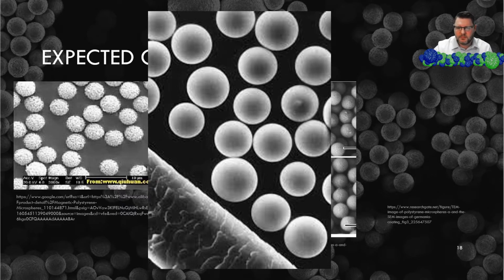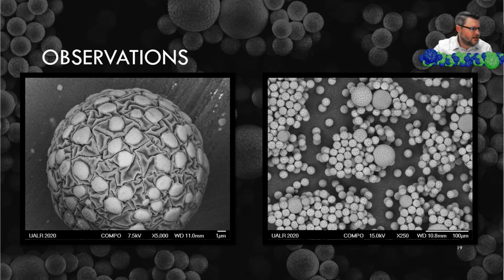So, but anyway, they almost look artificial. The images don't quite look right. This is what we saw when I imaged our sample. First, the images before, the spheres were relatively smooth, or extremely smooth, really. What we did is we allowed our sample to dry completely on aluminum foil, and so the almost raisin-like surface is because the spheres were allowed to dry just in air.